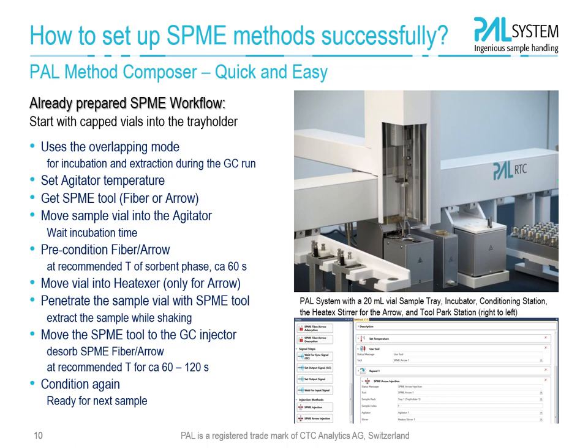For the SPME analysis, there's already a complete SPME workflow prepared, from the extraction to injection, as we see it here in blue. It uses the overlapping mode for the incubation and the extraction during a GC run. It sets the agitator temperature, takes the SPME tool, fiber or arrow tool, and moves the sample vial into the agitator. Here we wait for the incubation time.